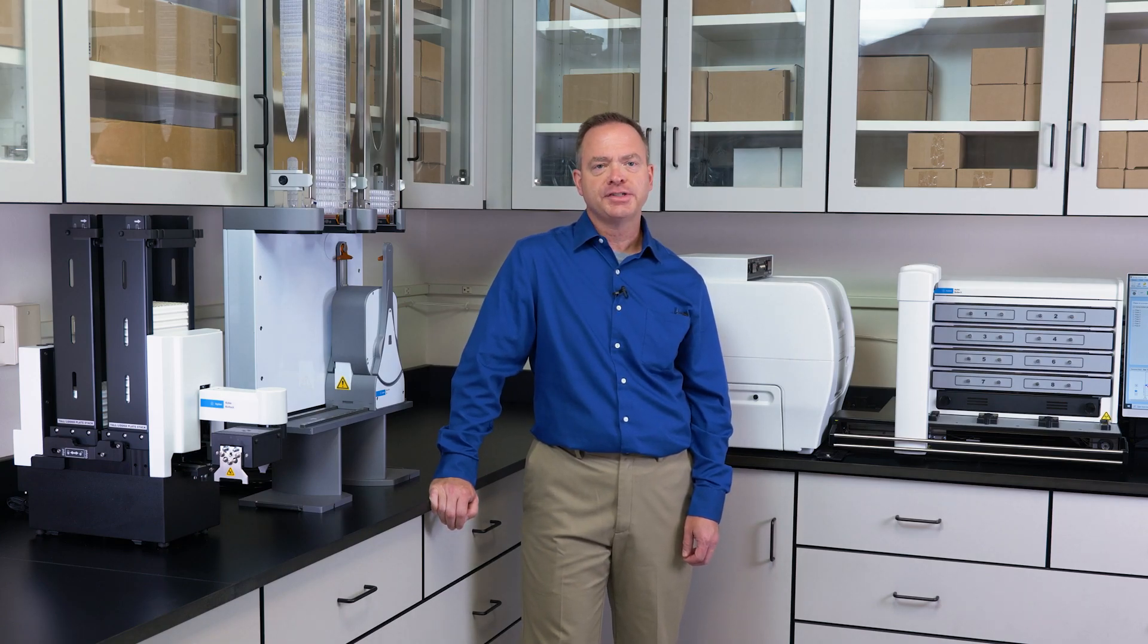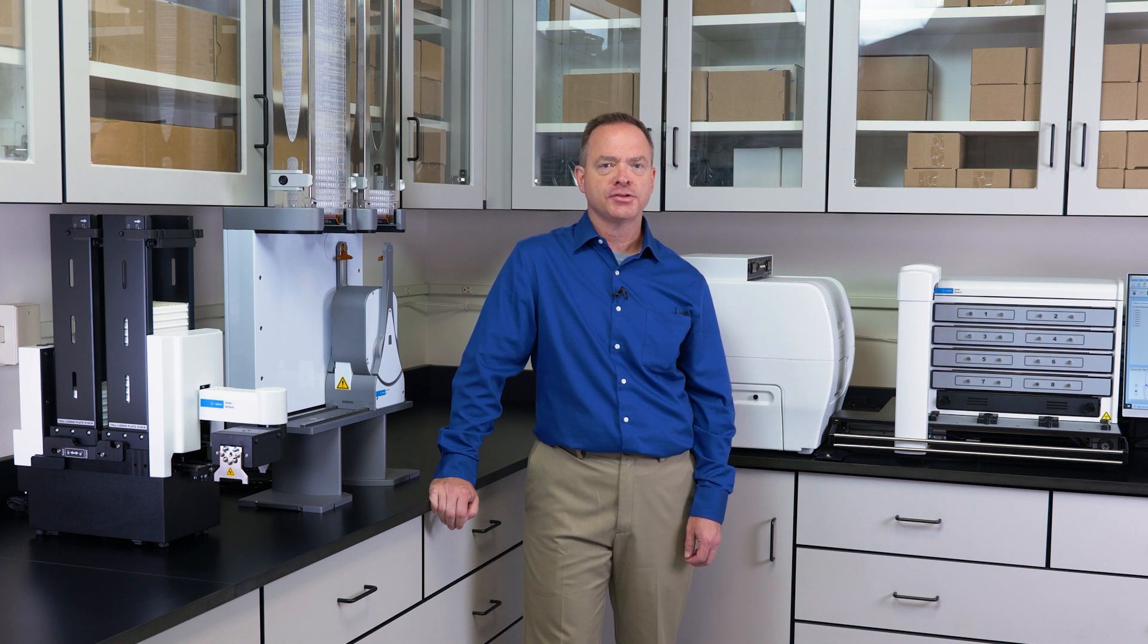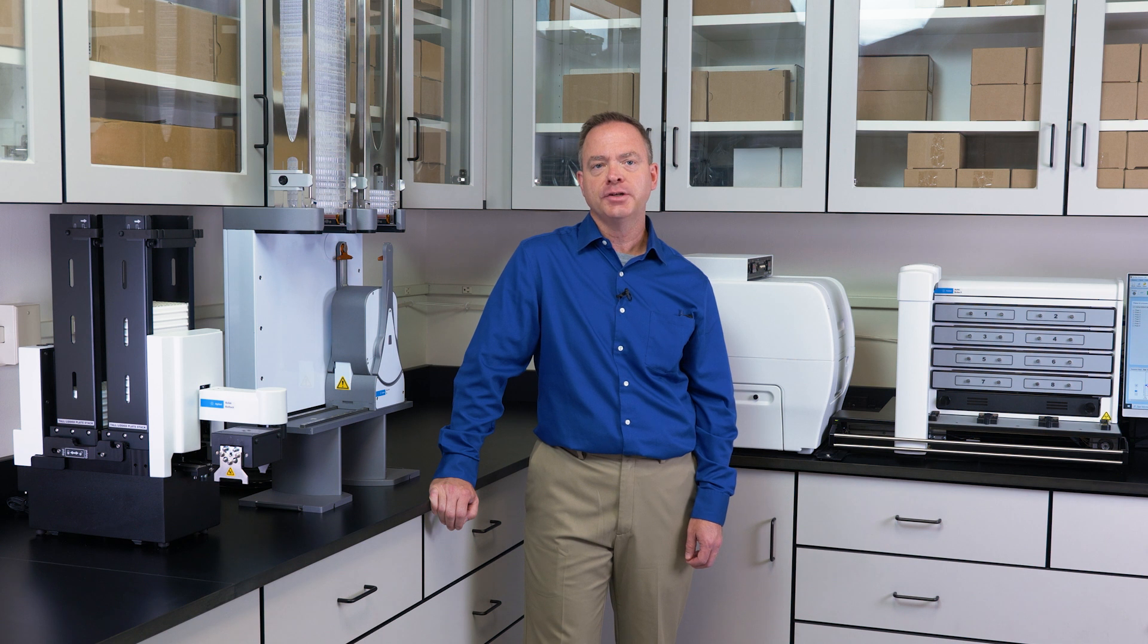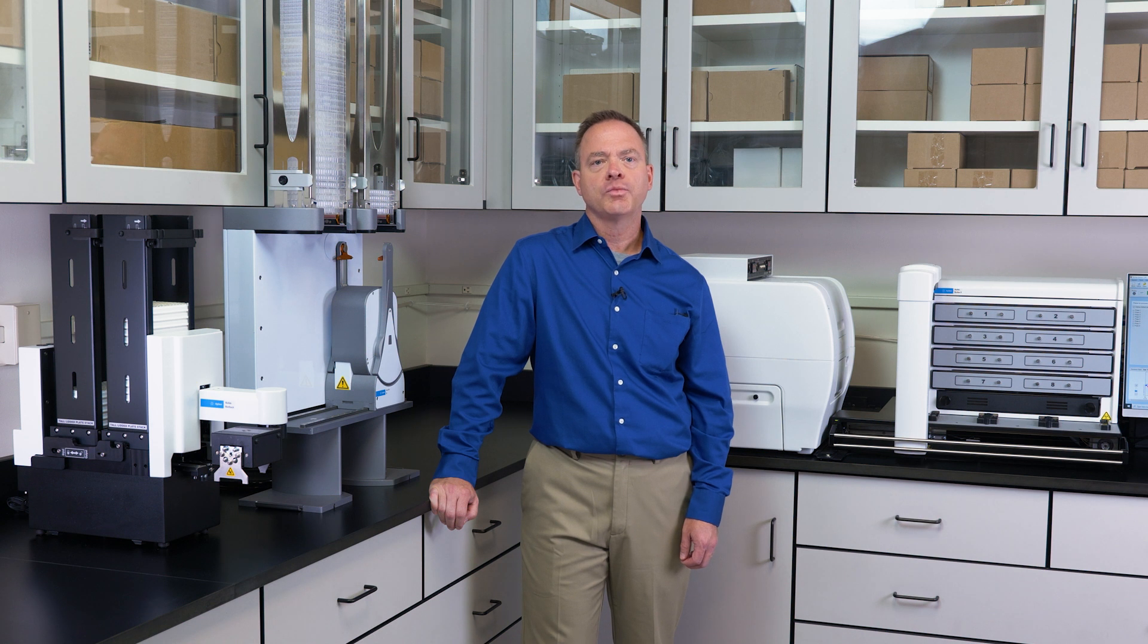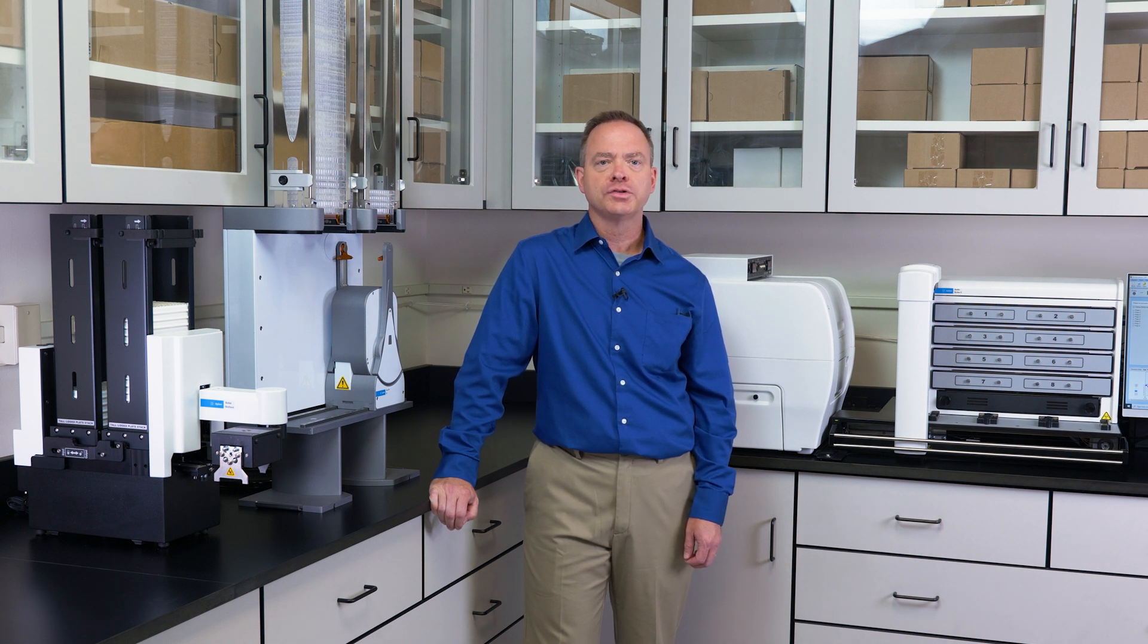We hope that you have been able to learn a great deal about the BioStack, BenchCell, and BioSpa, and how they can be used in cooperation with Agilent Biotech's liquid handling, reading, and imaging instrumentation. If you wish to learn more, we urge you to contact your local sales representative. Thank you very much for watching.